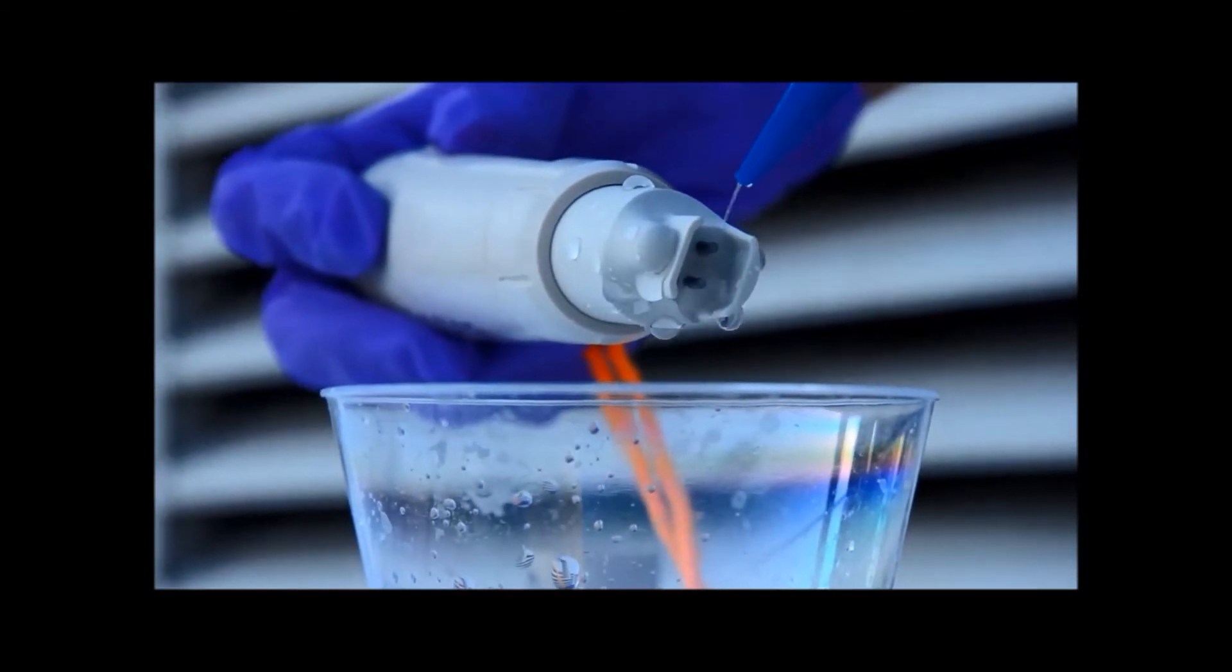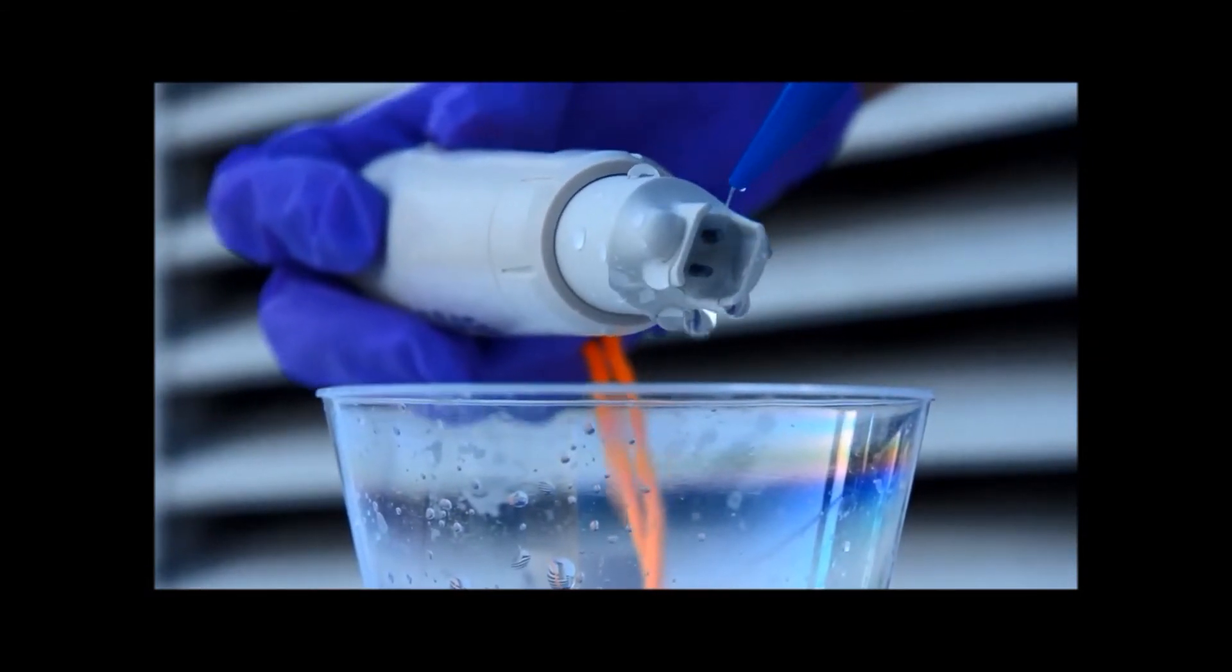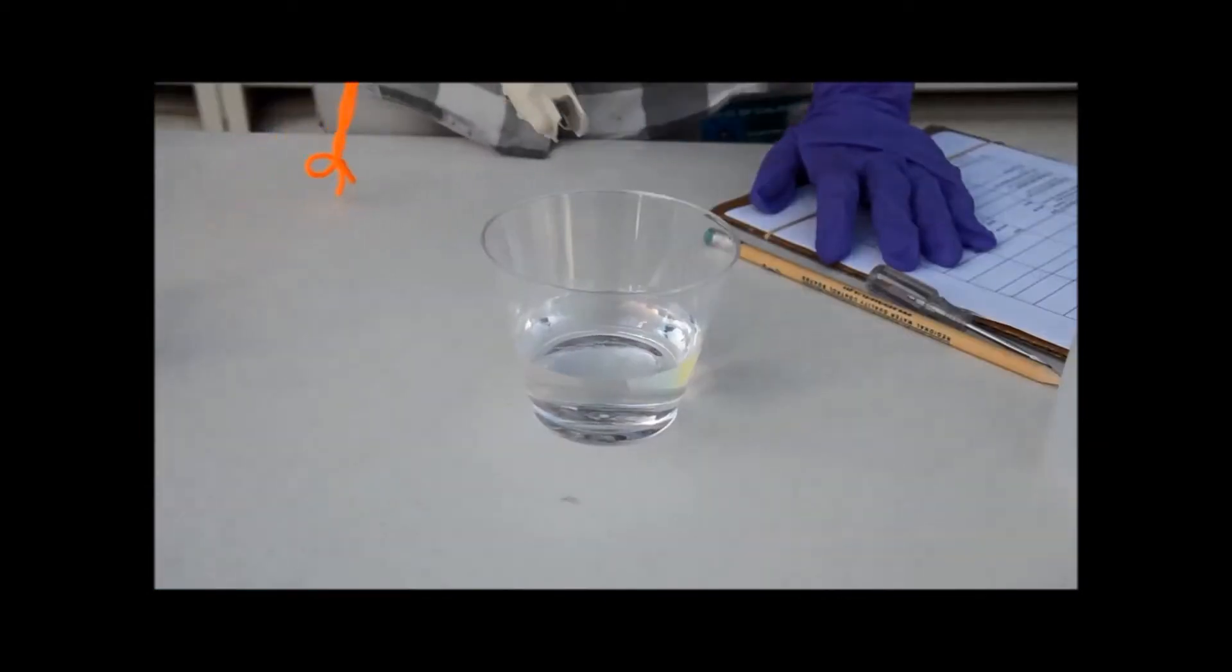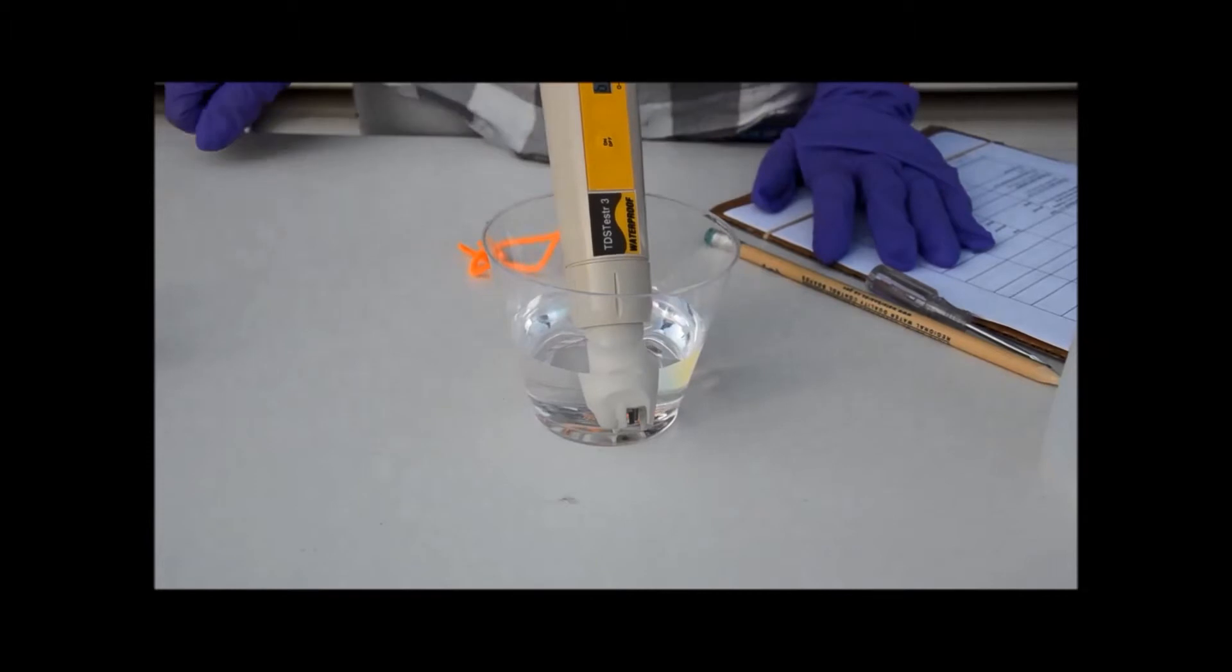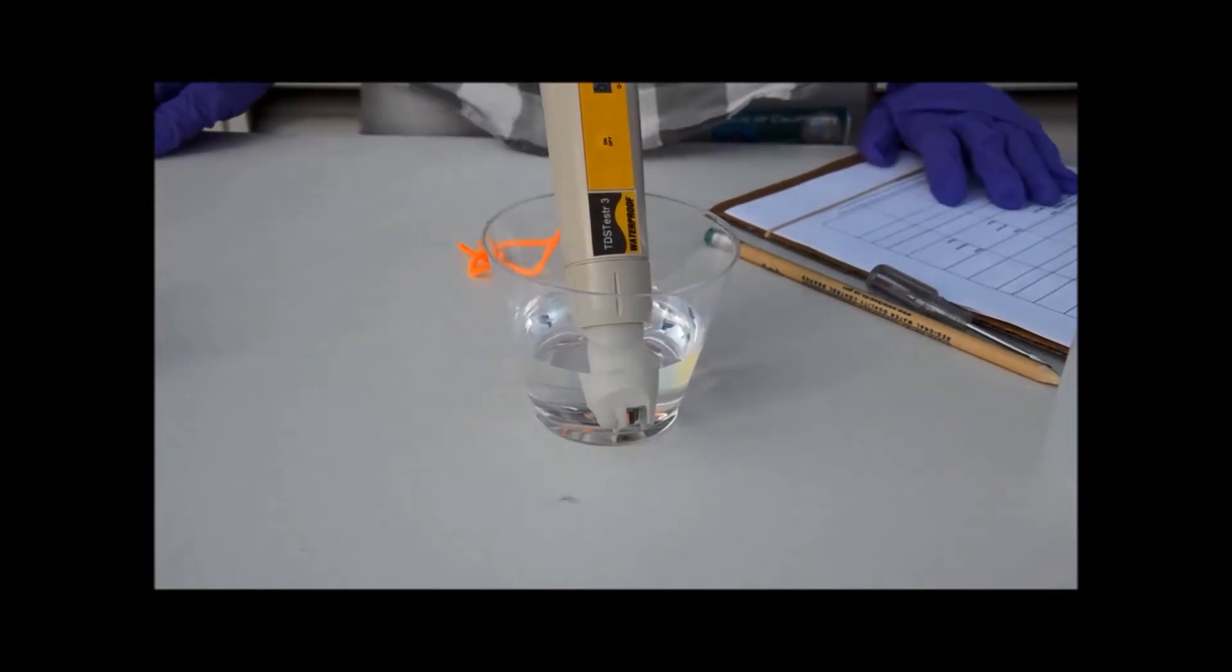Place your clean TDS probe into the container filled with fresh calibration solution. Check your meter's digital readout and compare it to your calibration standard. Record the value of this first reading.